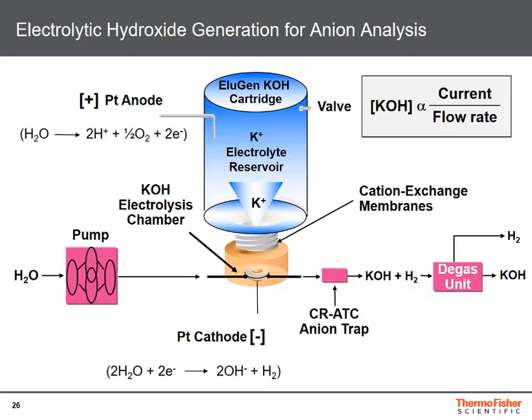In the upper right, you see that the generated hydroxide solution or hydroxide concentration depends very much on the applied current. The higher the current, the higher the potassium hydroxide concentration.